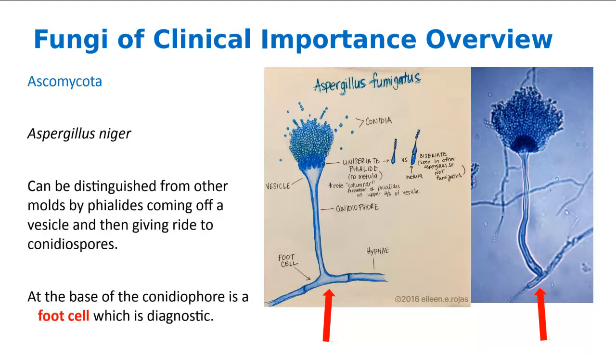So Aspergillus, remember I said that the higher fungi, their spores grow outside of a vesicle. Now with Penicillium, that has no vesicle, it goes right from mycelia to phialide to spore. But if I was to draw this organism, and I'm not very good, but I'll do my best, here is the vesicle.